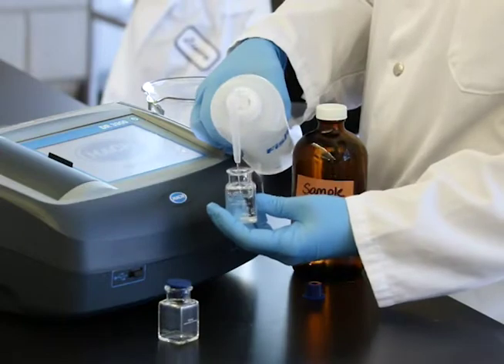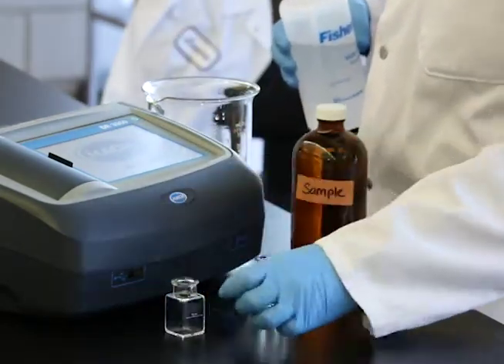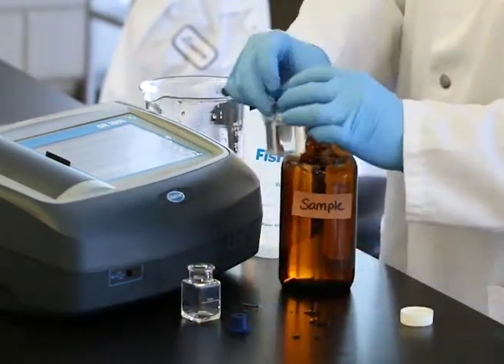Prepare the blank cell by rinsing and filling with deionized water to the fill line. Prepare the sample cell by rinsing and filling with sample water to the fill line.